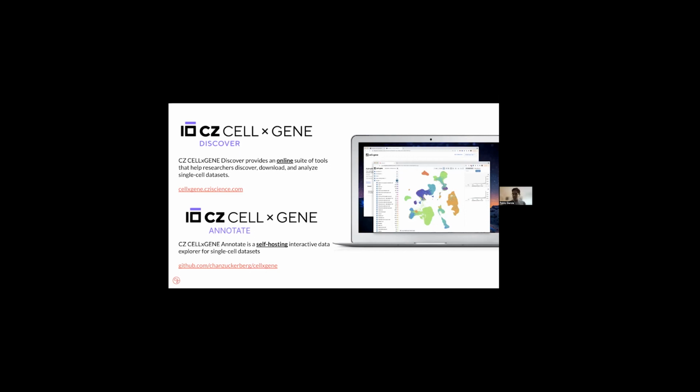And CELLxGENE Annotate is a tool that you install on your own machine. It's a small part of the portal, but you can install it on your desktop or laptop and self-host it for sharing among your close circle of researchers. Max is going to be giving a demo of that later on in the presentation. And I'm going to start talking about CELLxGENE Discover, which is the online tool.